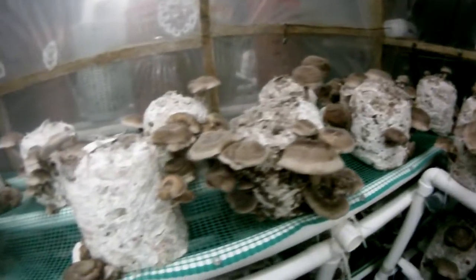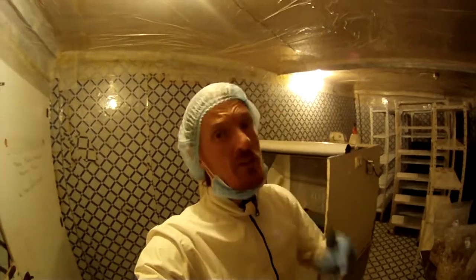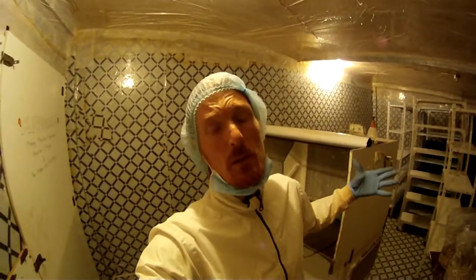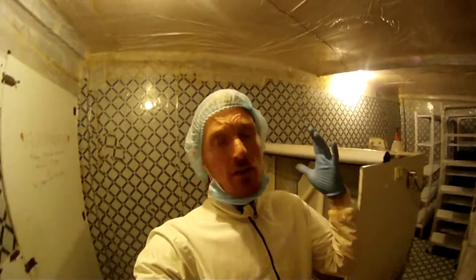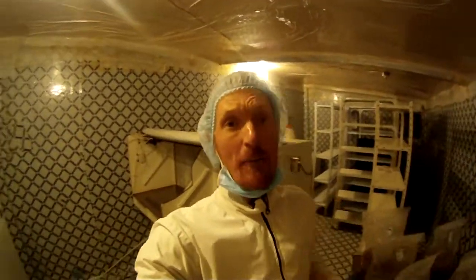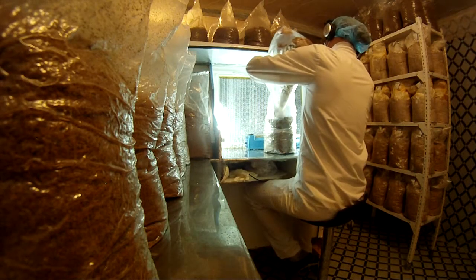The main thing to a mushroom growing operation is your lab. If you don't have a lab, you can order spawn from other people and just have the grow rooms part. That works. If you're just a home grower, you can order stuff from people that do have a lab. But if you want to create your own spawn, you need one of these - a lab.